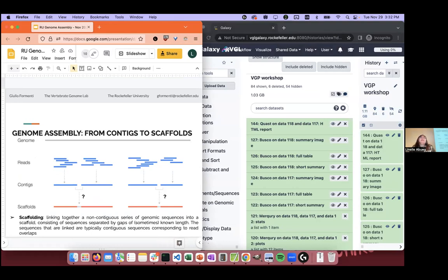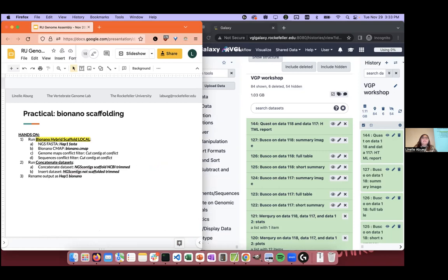Generally, no. I've done maybe 10 to 15 HiFiasm Hi-C ones. I've only had to purge once. Just like trio data, there's just no purging. I can introduce this one slide because it's so practical.